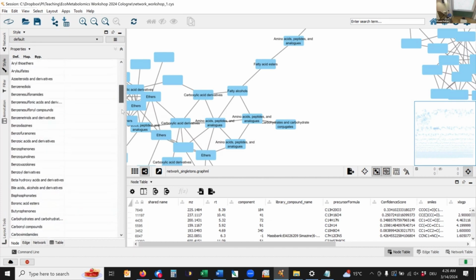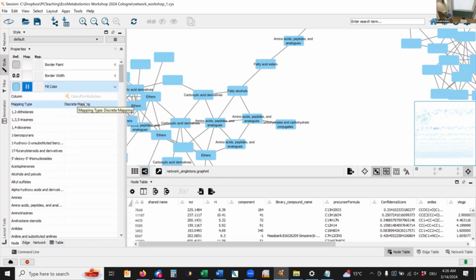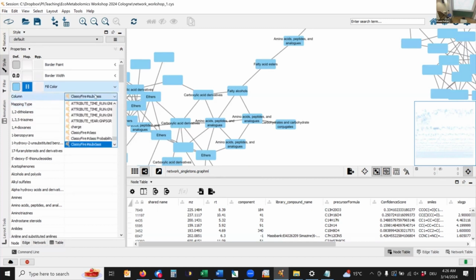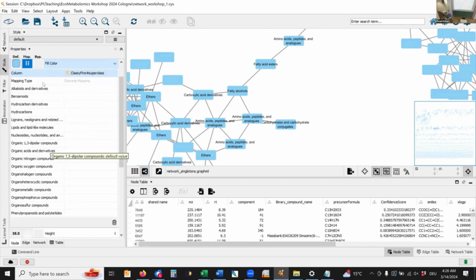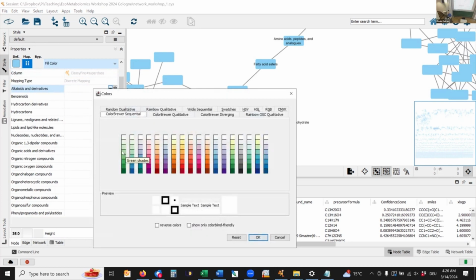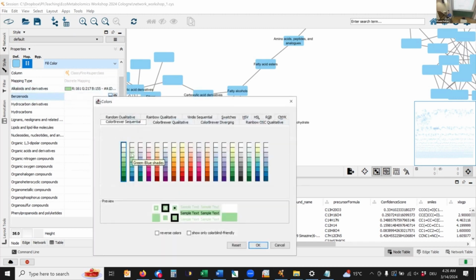And then I see already, oh, there's many different variables. So maybe I cannot select sufficient colors to do that efficiently. So then I would go one level higher to superclass, and then I have fewer variables. And then I can select different colors to indicate which nodes are what.